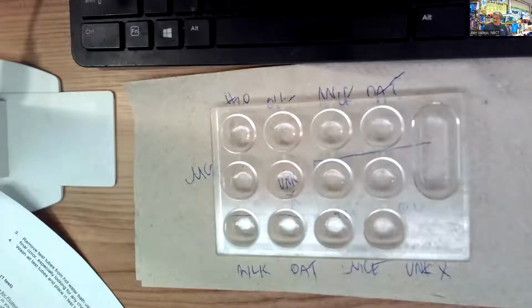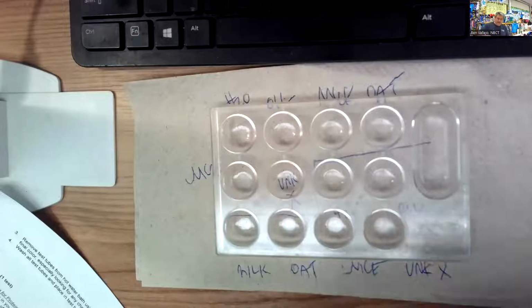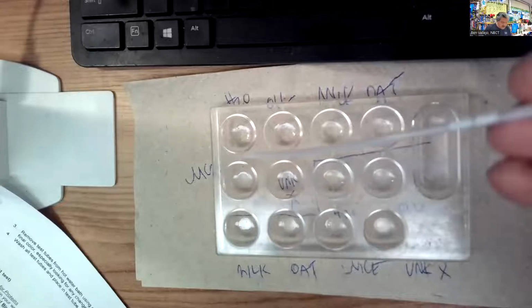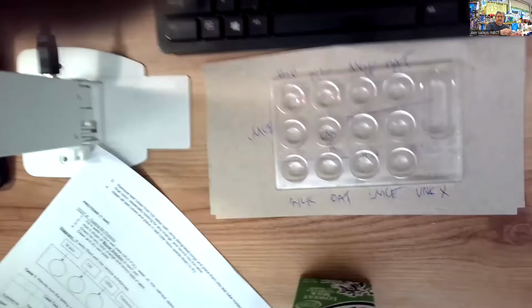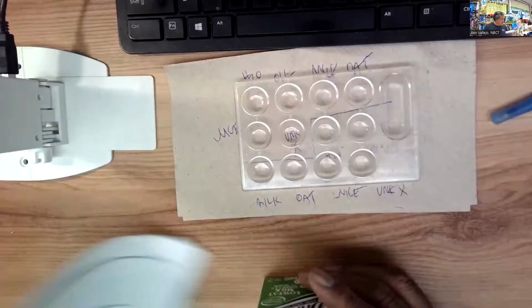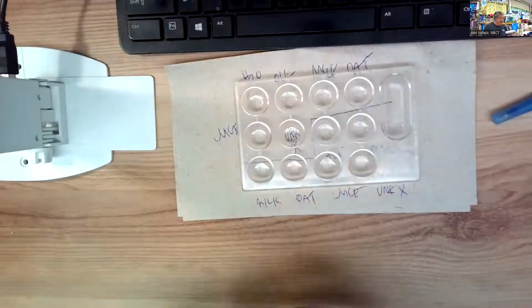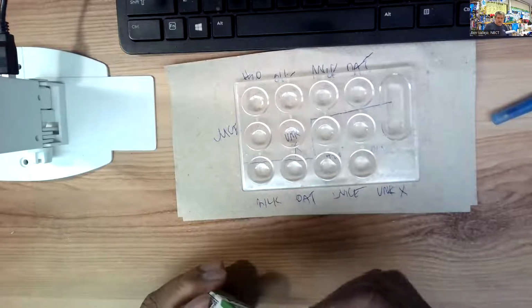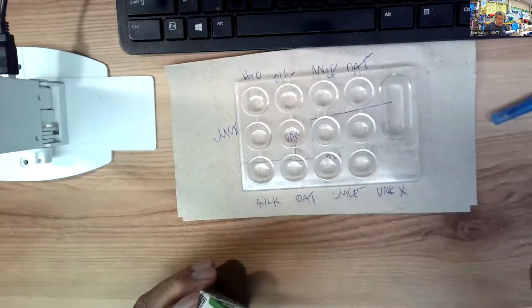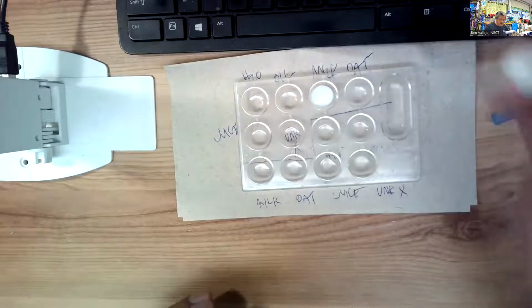Ooh, all right, so we're going to put the solutions in the well plates. But just a dropper full of each liquid will give you a good idea. Go a little further out. Ready? So here's a squirt full of milk.